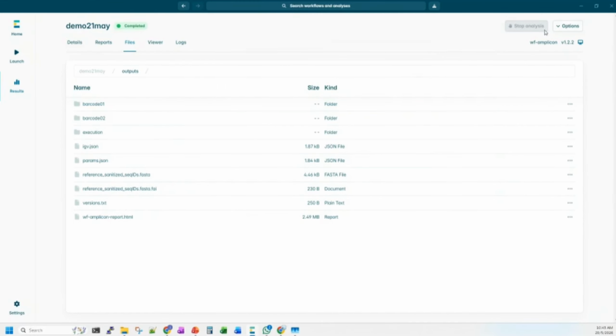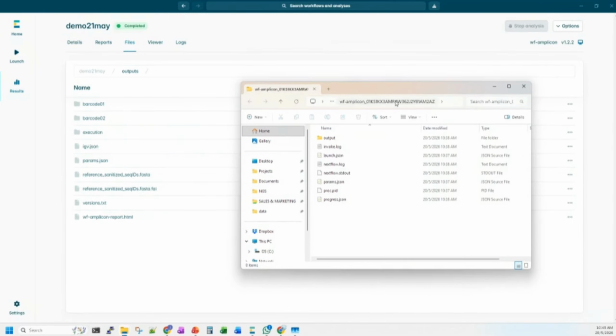And then this is how we can get our analysis result files. Optionally, we can also click over here to check some information about the analysis run, including renaming the analysis, or, in case the analysis is no longer required, deleting it over here. And sometimes I prefer to directly open the folders of the analysis run to get all the files listed in my file explorer over here.